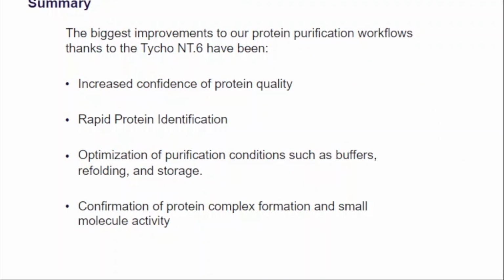Once we have a good feeling of how the sample reacts each time to the Tycho, at what temperature it unfolds each time, as we make many batches of our protein, we're able to really quickly identify the protein, and that saves us time to move on to the next steps in our protein protocol while we run gels or traditional methods to evaluate the success of our purifications.